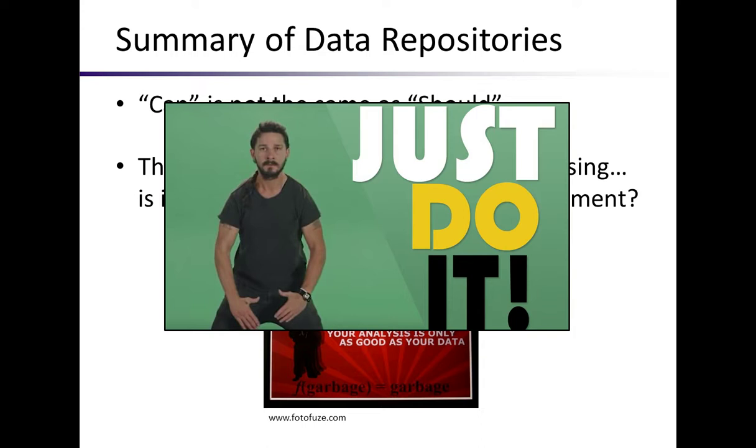So in summary, when we're talking about data repositories and prediction algorithms, I can use these. It's not the same as I should use these. And I just ask that you think carefully about how you're picking the data, how you're picking your peptides, and ask yourself the question, is this what you want for your experiment? Because this is the very base, fundamental structure of your assay. And if it's not done well, you're not going to have as good of an assay as you could, right?